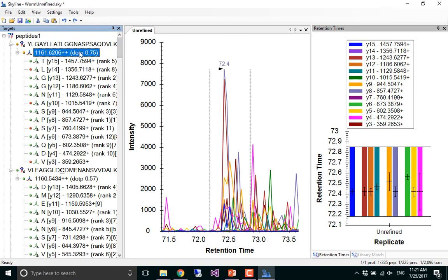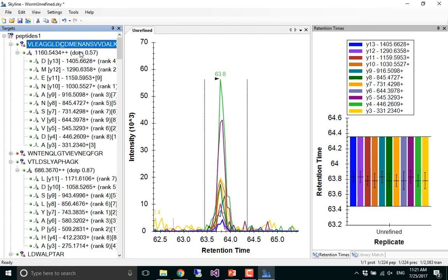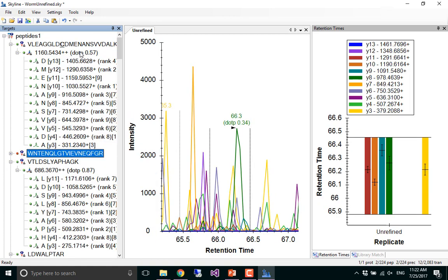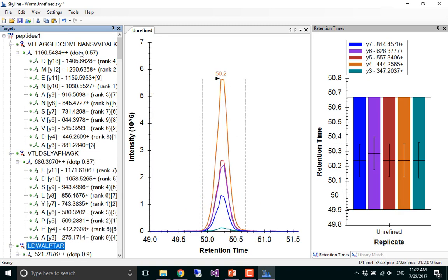So let's look at some of these things and decide whether we keep them for the next round or get rid of them. Right? So we could do this manually. We could go down here and say, no, not keeping that one. Yeah, that looks good. Probably this red one's not going to look any good. This one looks good. And we can get through it, it's 223, probably pretty quickly, but there are some automated ways of doing this also.